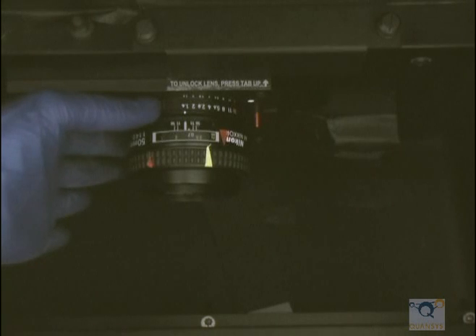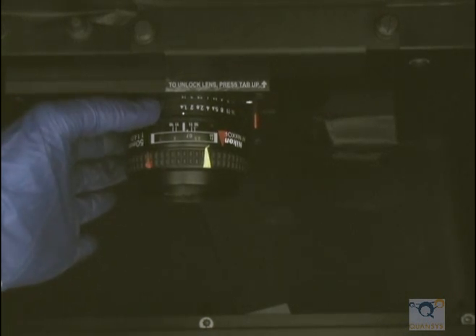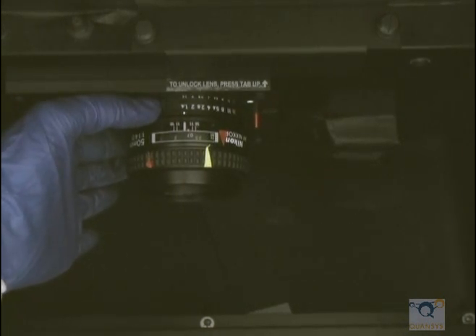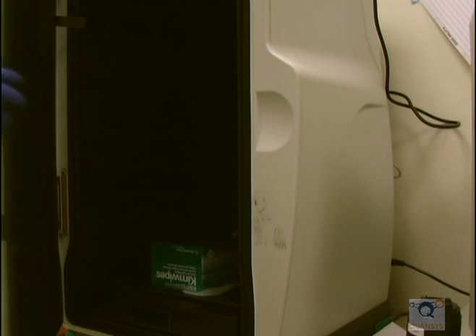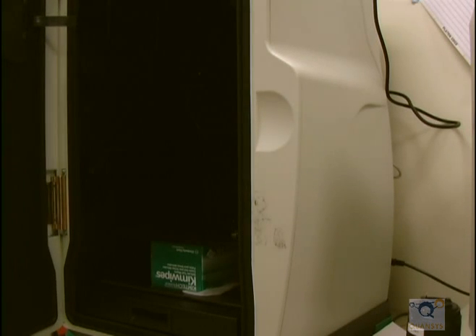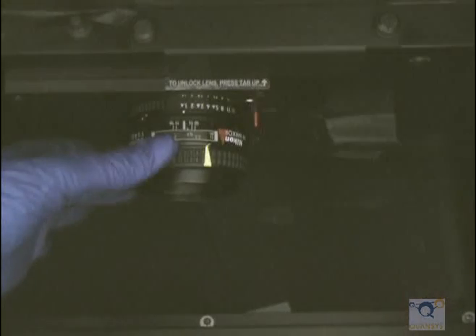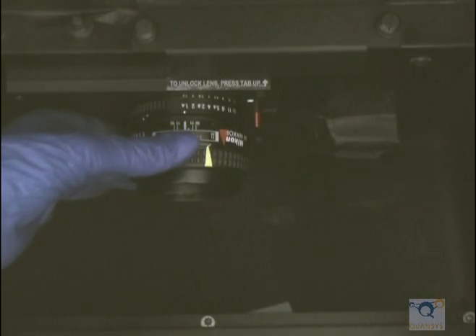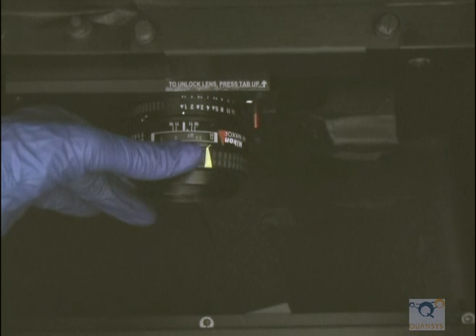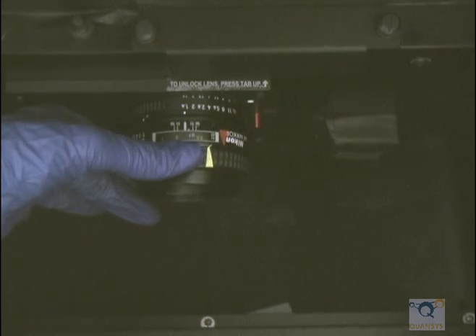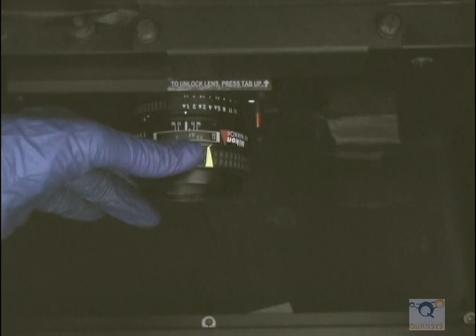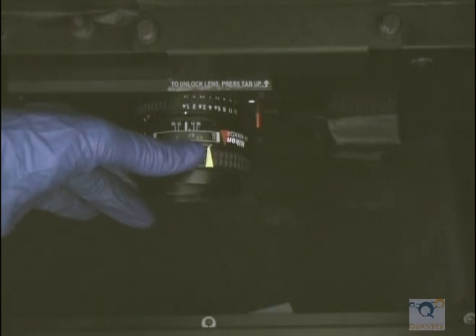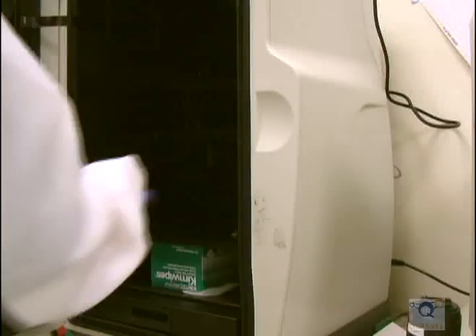Open the aperture on the camera all the way to the lowest value. Leave the camera door slightly open to let in light while focusing. Click on Focus in the software and turn the focus on the camera until the imaging targets on the screen are in focus. Click on Stop when it is in focus.